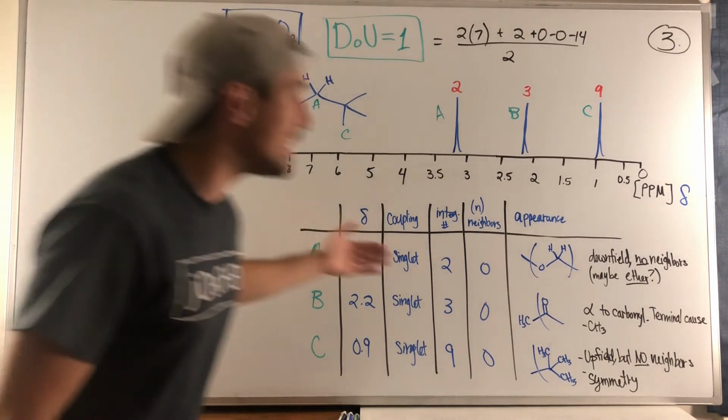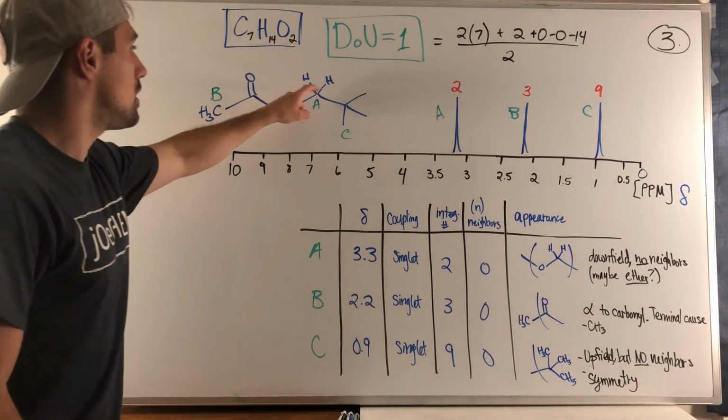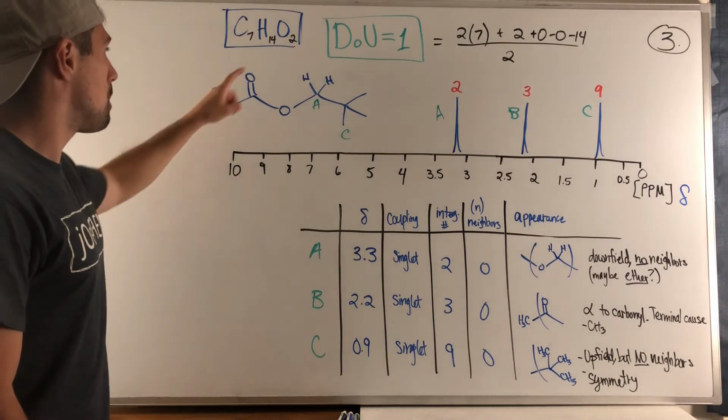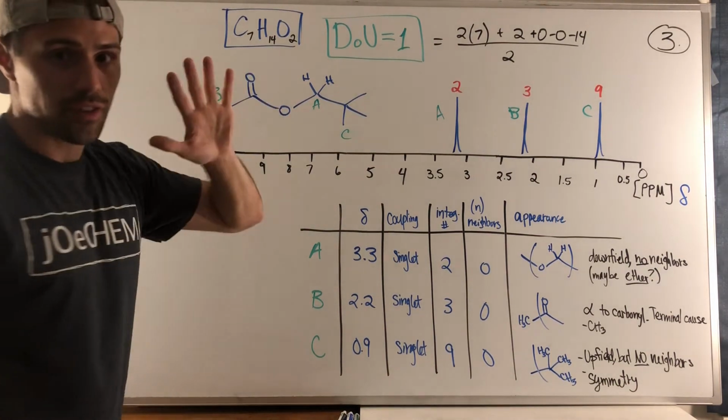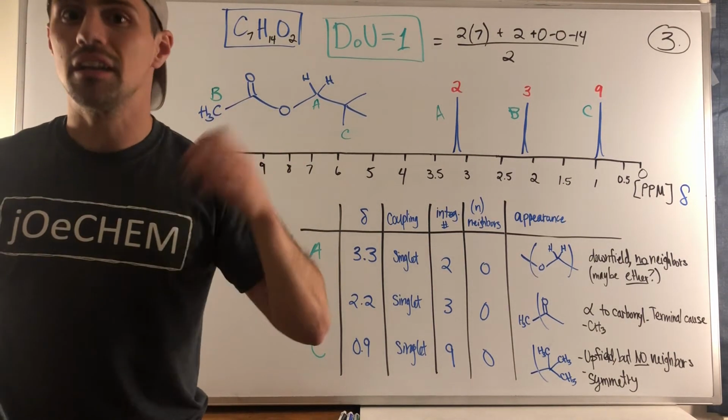Right now we're in ether country. So I hope you see that 1, 2, 3, 4, 5, 6, 7 carbons, 5 plus 9 is 14, 2 oxygens, got the structure.